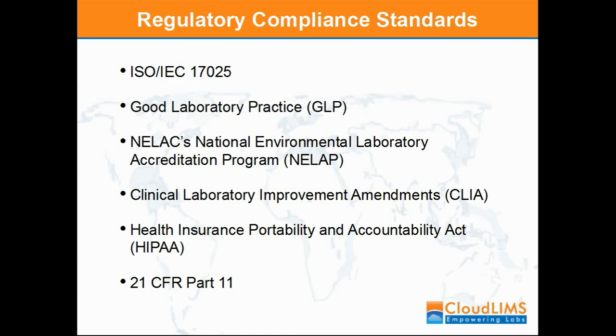It also creates an audit trail on viewing and altering of such data. In order to develop an effective security program, all users in the system leave an electronic signature for viewing and changing restricted information.